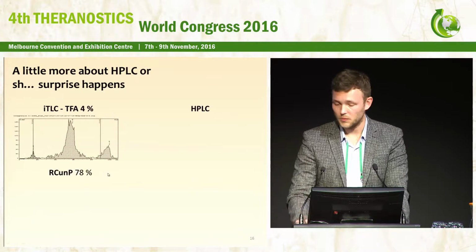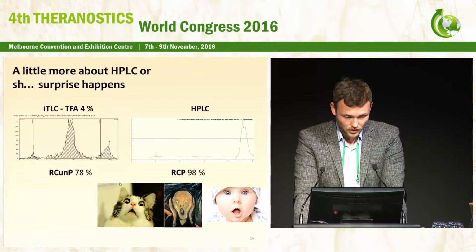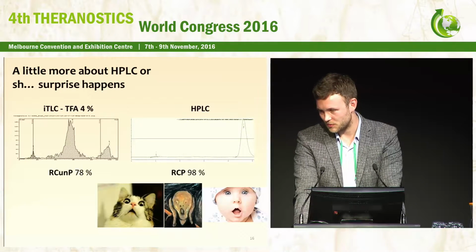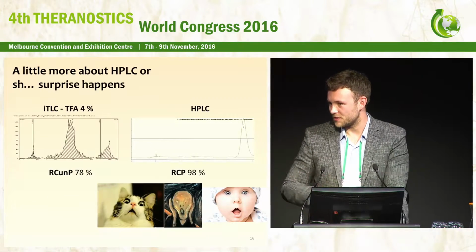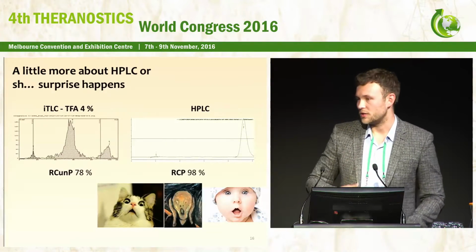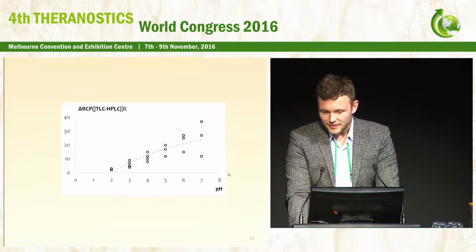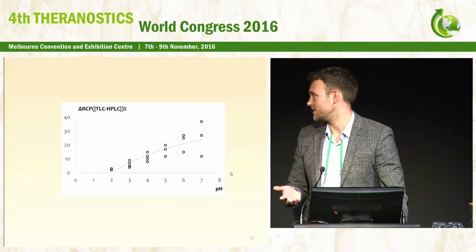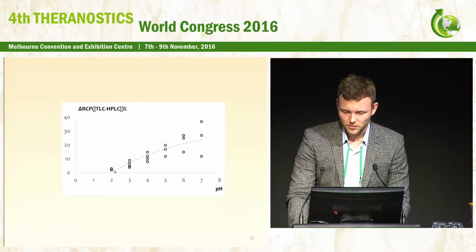But when we tested with the HPLC, it was 98%. At first, we thought that we were crazy or something had gone wrong. We checked the chromatographs, changed the columns, but again and again the situation was repeated. It does not necessarily mean that you will find this situation in your routine work, but just look here.